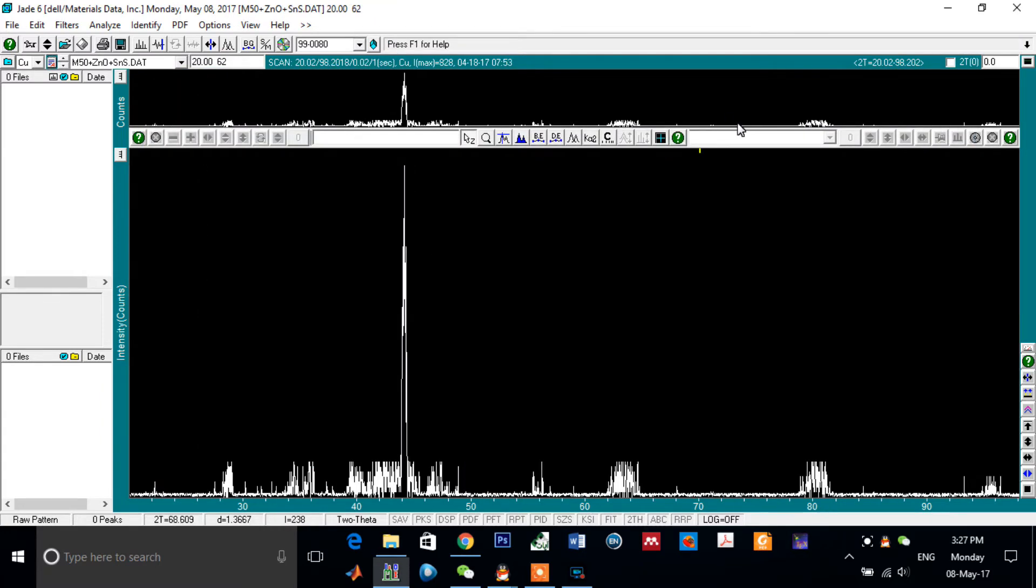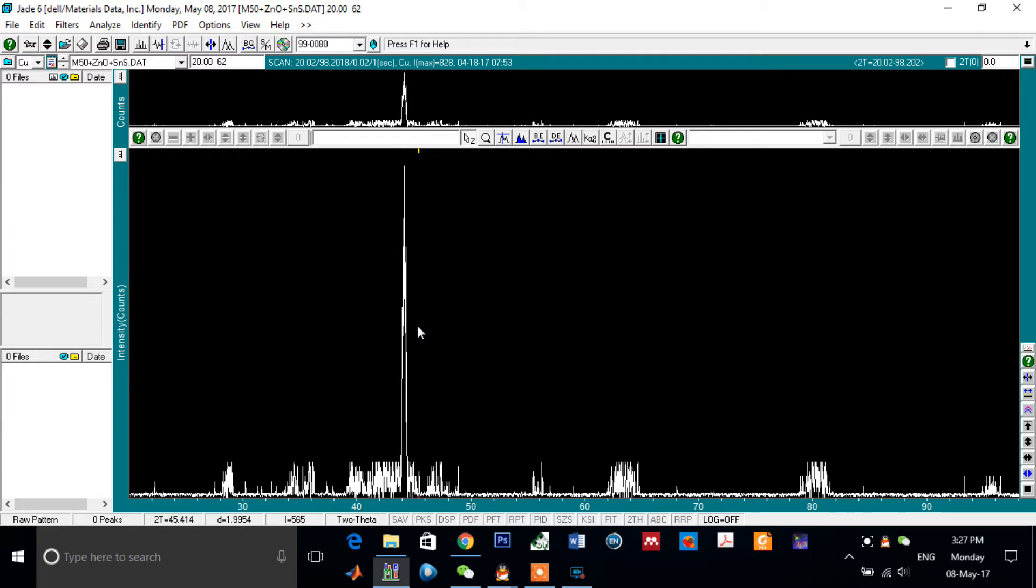What you can see here is the diffraction pattern of the sample. This is the diffraction pattern of the sample, and these are the peaks. This is a big peak, and this is a small peak, another small peak.